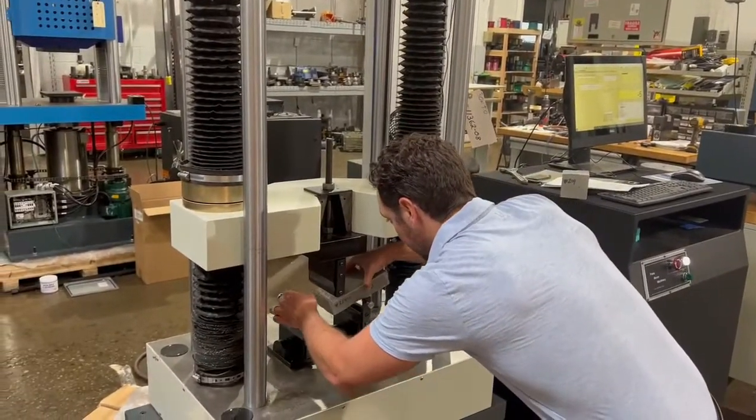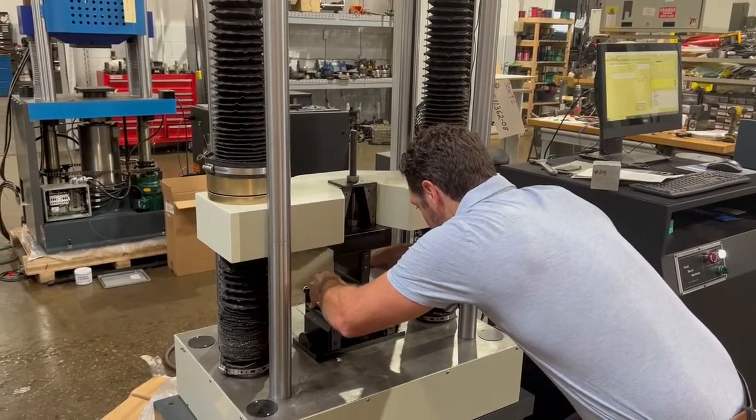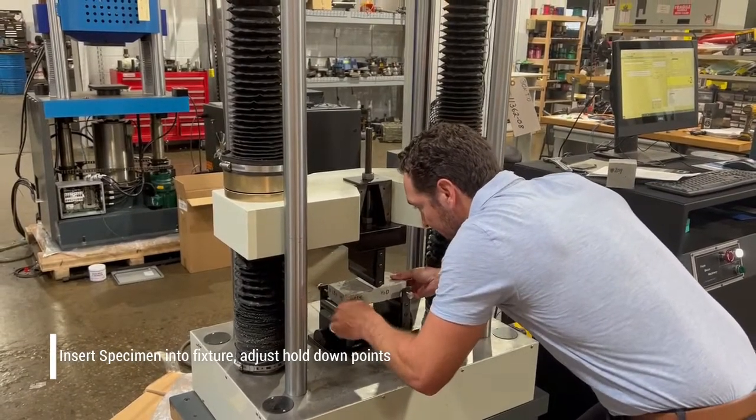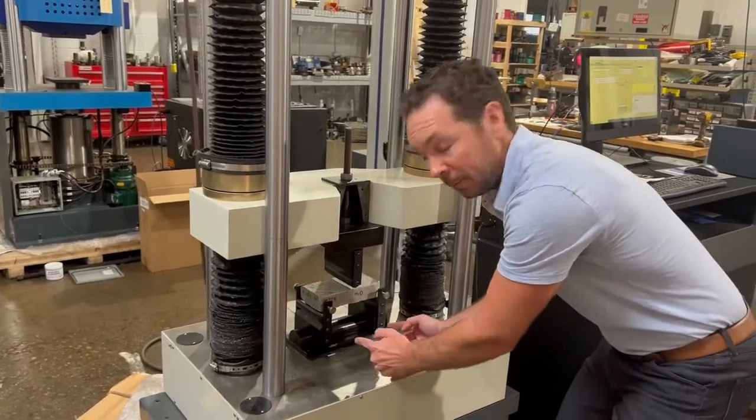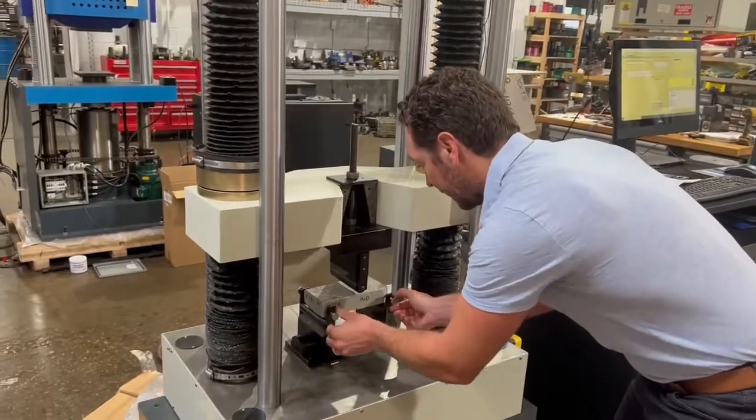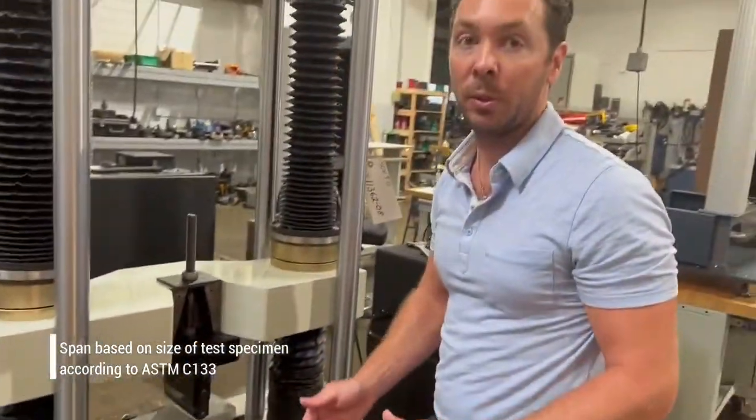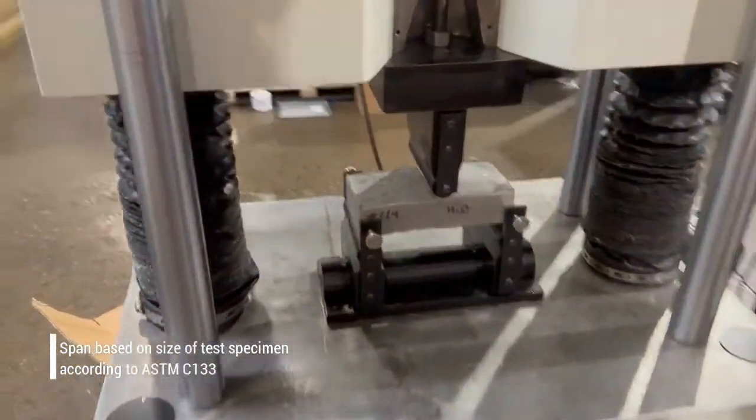Basically, insert your specimen into the fixture, adjust your hold-down points, slide it in. Right now we have a seven-inch span based on the size of our test specimen. That is all called out in the C133 procedure.